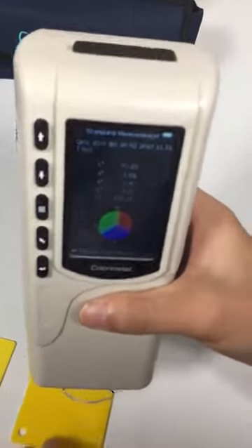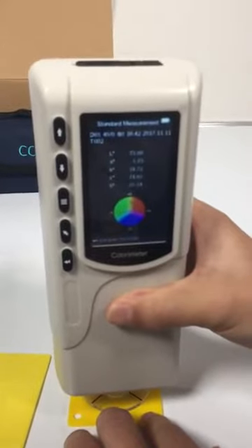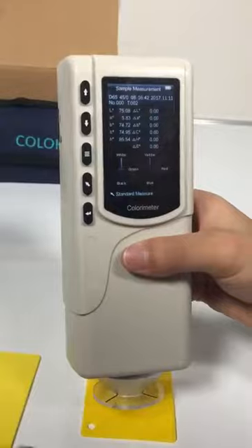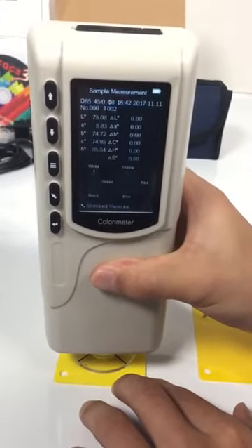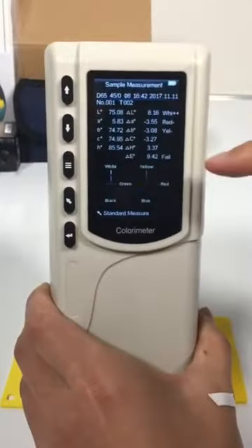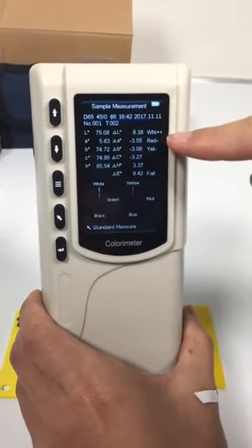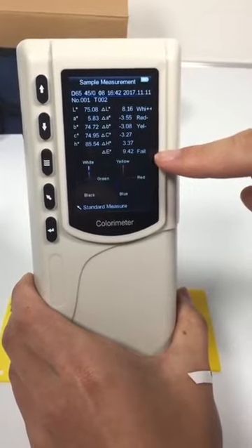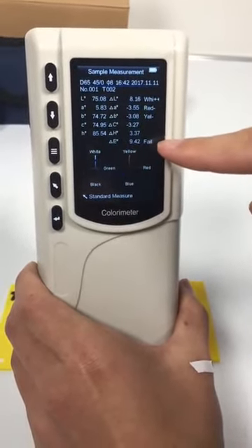Mirror a standard first, and then mirror a sample. These are the test results. This is the color offset indication, and this is the test result judgment. The delta E is too large, so it shows fail here.